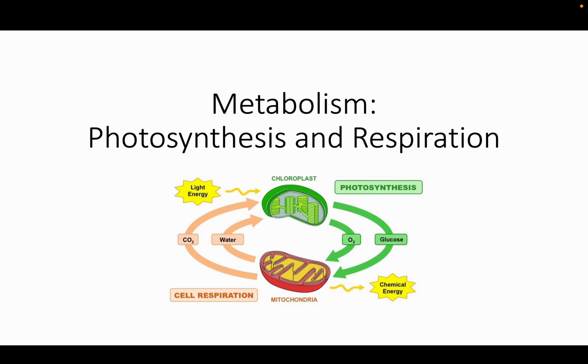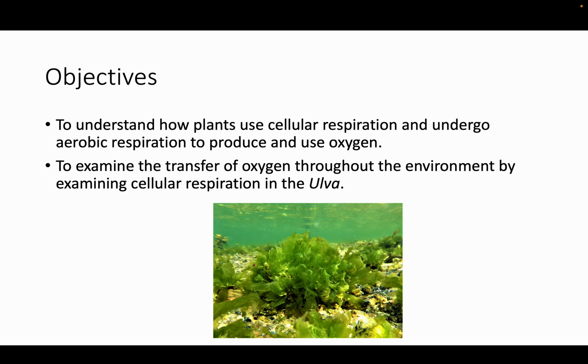All right, hello everyone. This week we are going to do a lab on metabolism. And in the metabolism lab, we're going to examine different types of chemical reactions and take a look at how metabolism works in the Ulva lobata, which is a sea lettuce.